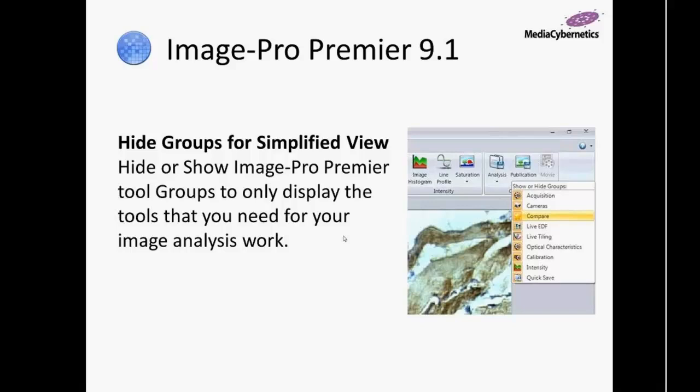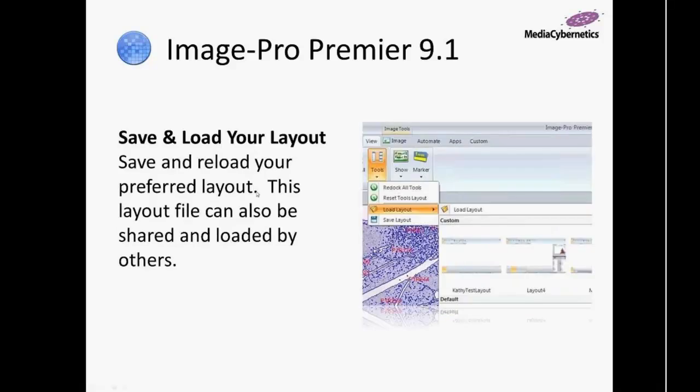Now let's say you wanted to combine both of these options. We've added that as well. We've made it available now to save and load layouts right from within the product. Simply by creating the layout that you want with either tabs that are hidden, groups that are hidden, or even dialogues and menus that are in specific locations.